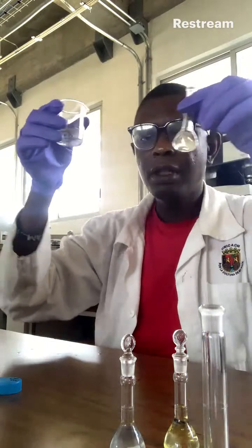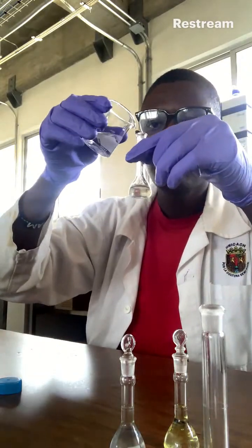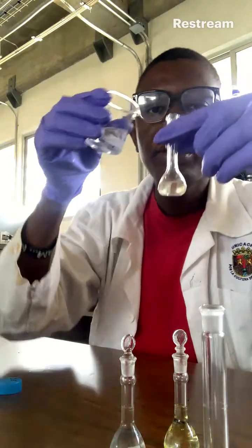Now I'll have to dilute it with isopropanol. I am diluting with isopropanol.